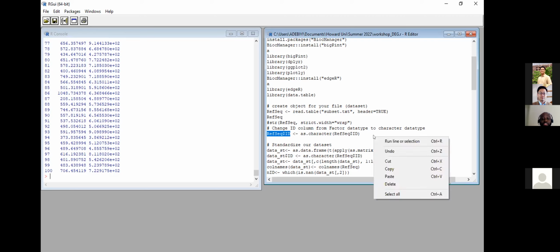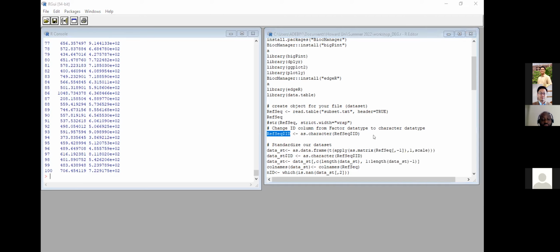I think I have some messages. If there's an error message, all right, we'll fix that. For those having errors, I just want to run through it, and then we'll go back to fixing the issues.